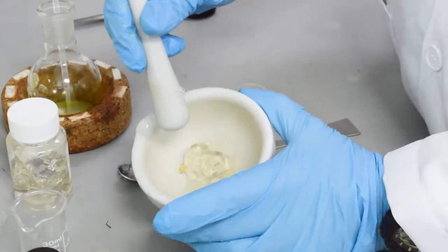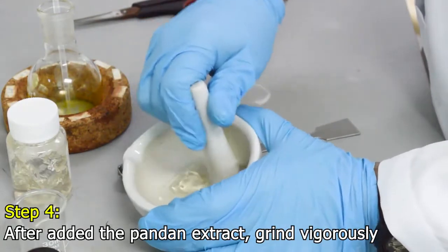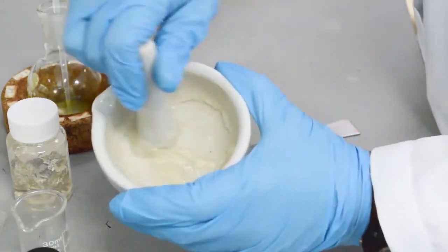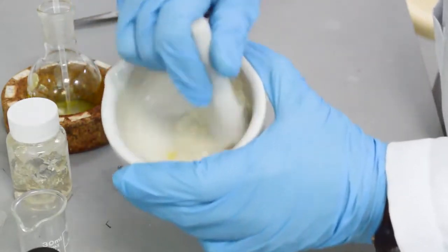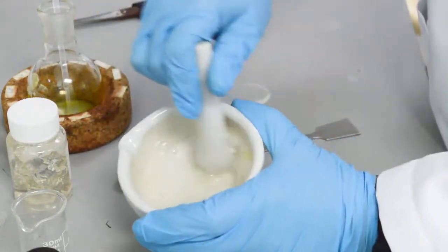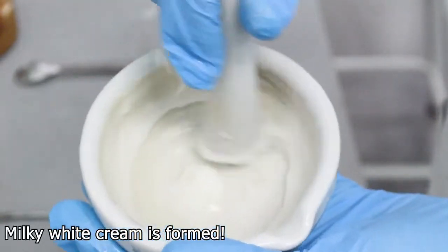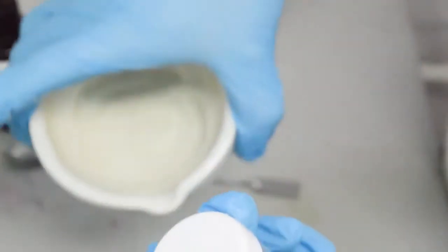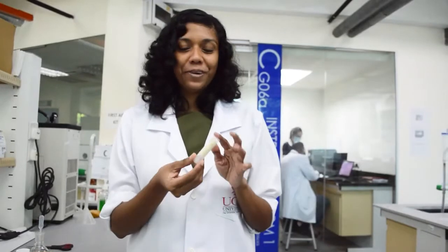After putting all the ingredients inside the mortar and pestle, we need to grind it vigorously until it becomes a milky white color. Make sure you grind it vigorously to form a uniform milky white mixture. As you can see, the mixture has now formed the milky white color. I will put the body lotion mixture inside this container — and voilà, it's done!